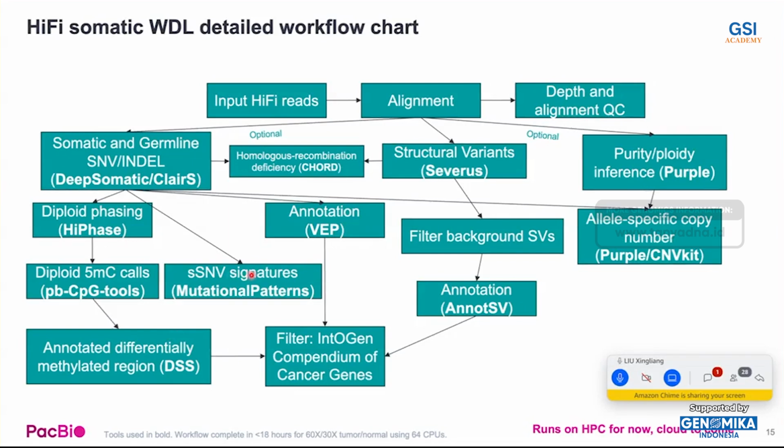The pipeline also provides mutational signature decomposition derived from the SNV calling results. As you know, after Mike Stratton's lab published the first mutational signature paper in 2013, mutational signature decomposition has become routinely practiced when people study cancer whole genome sequencing, where we have enough samples and enough detected variants.